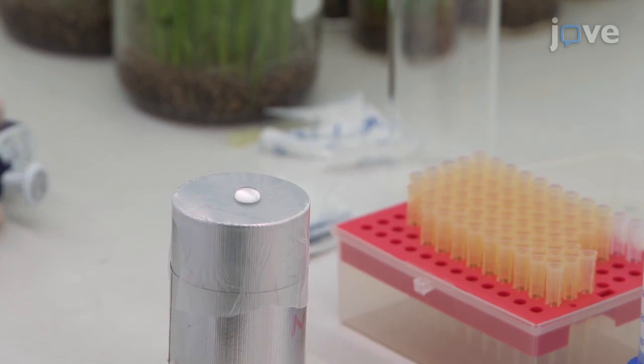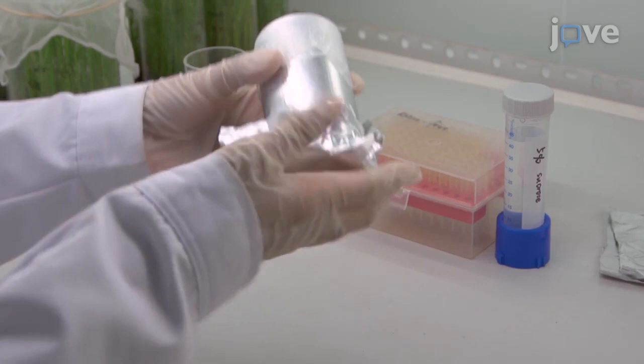Then, cover the liquid with another layer of stretched paraffin membrane. Finally, cover the chamber with aluminum foil, leaving the end of the chamber with the artificial diet device exposed to the light.